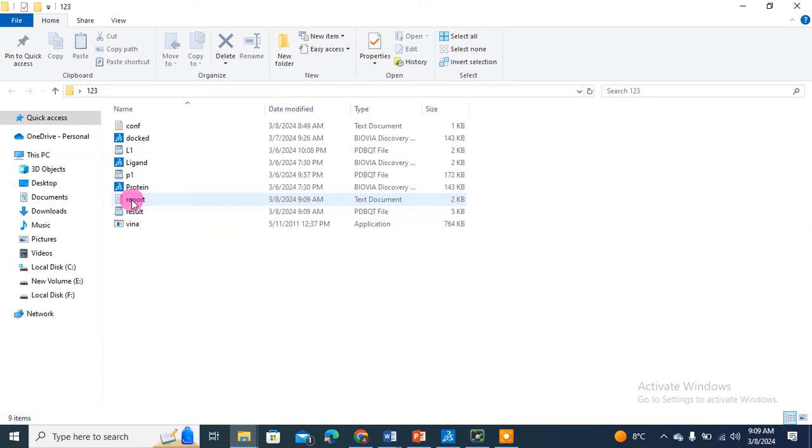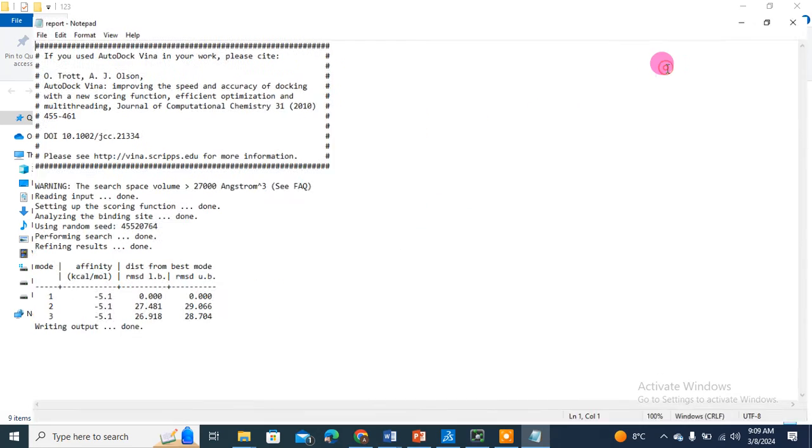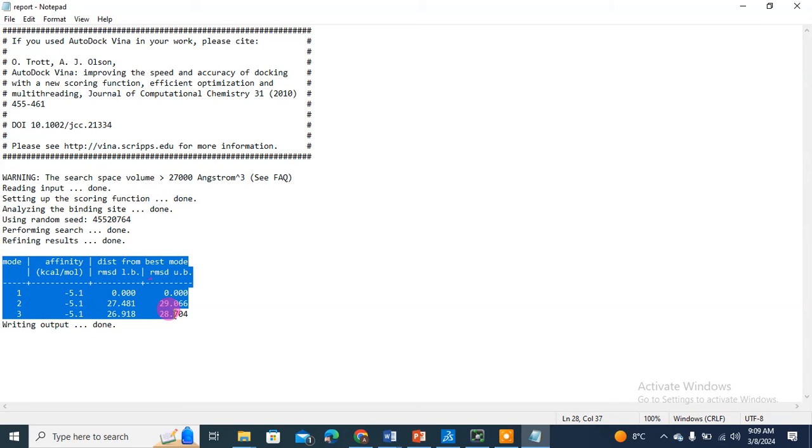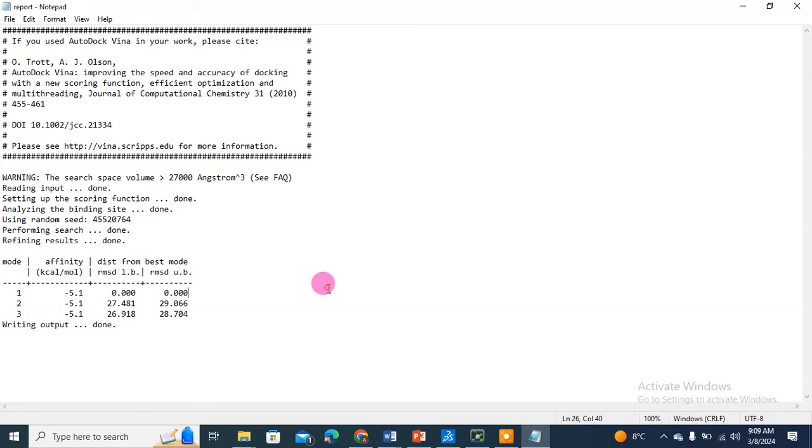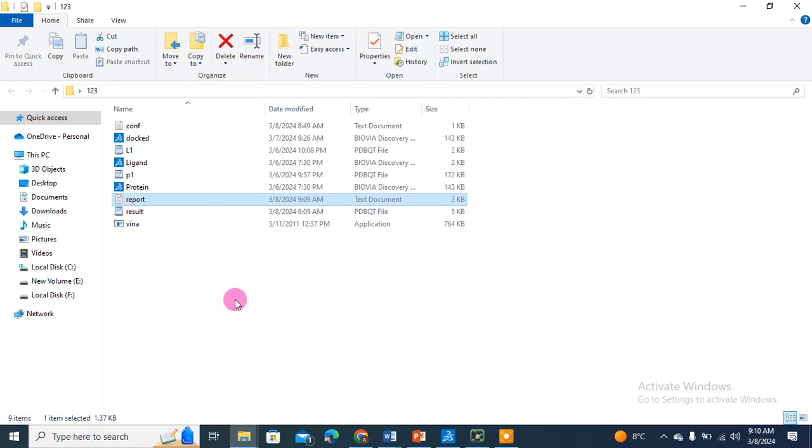We generated result.pdbqt last time also. This time we have generated another report file. You can use this very effectively - it was not generated last time. All the energies and information are copied here in this report. You can keep it for further studies. We have generated three poses. I have shown you two tricks and how to generate a complete report. Now finally, I'm going to teach you how to generate a PDB complex.